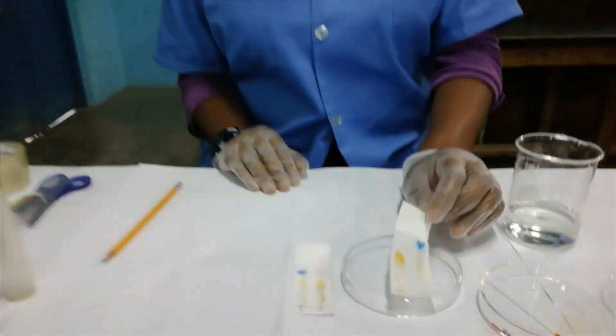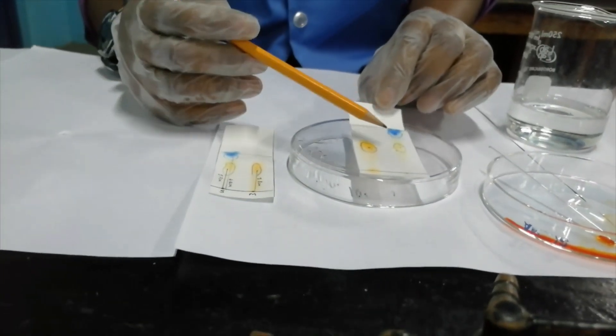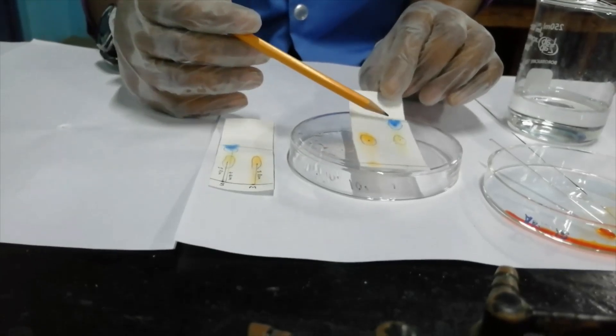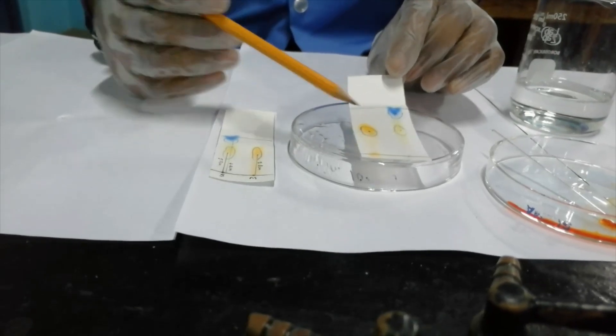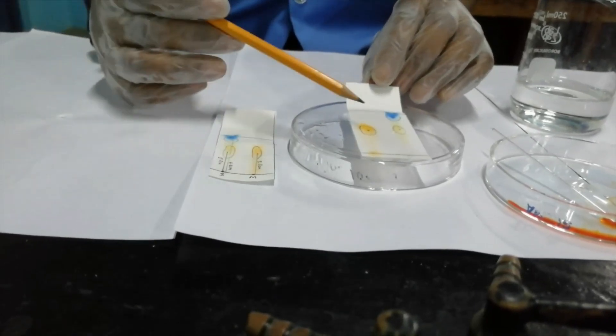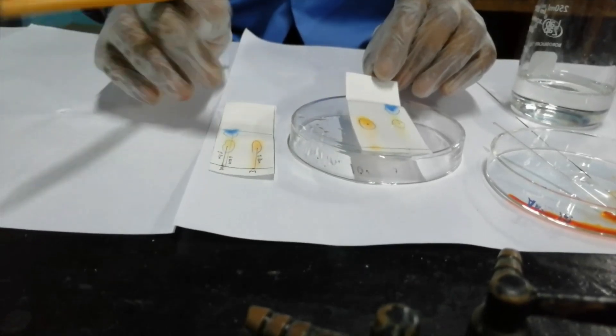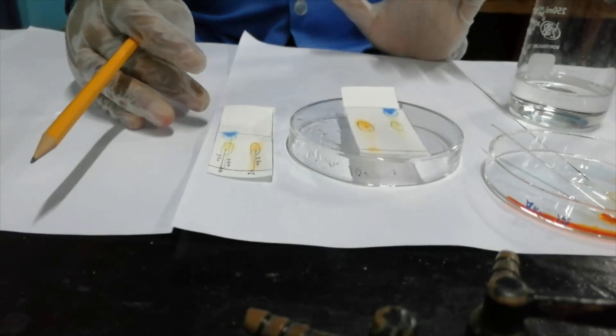The second chromatogram has been developed and I've already marked the solvent front and circled the spots. You have to be careful because it's still wet and you can see that it's still moving. This is what it looks like and I'm going to measure the distance traveled by each spot and put the values at the end of the screen.